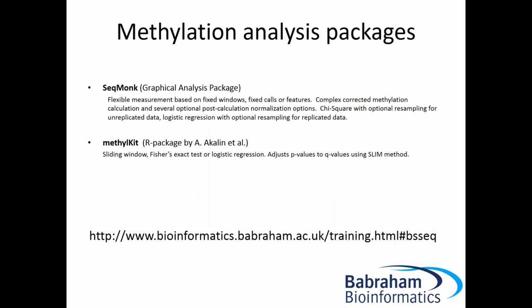Okay. So I'm going to finish by leaving you a couple of links to packages that you might find useful. So like I said, the stuff that I've shown you has all been done in the free graphical SeqMonk package, which does all of the visualization and statistics that we've done. It's an interactive desktop package, which is great for really getting to know and understand your data, and it's what we encourage people here to use.